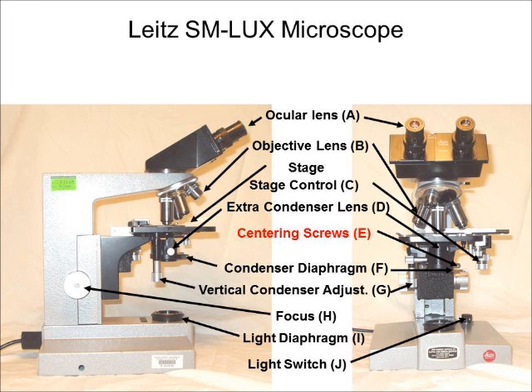Below this on the condenser are the centering screws. These are used to center the beam of light through the condenser. You will probably not have to use these since your microscopes are already adjusted.